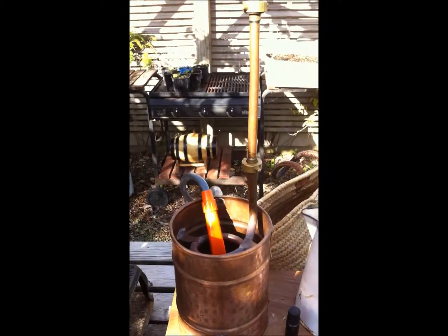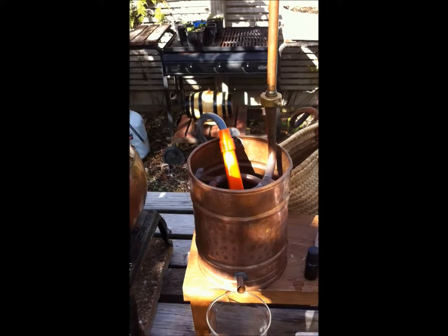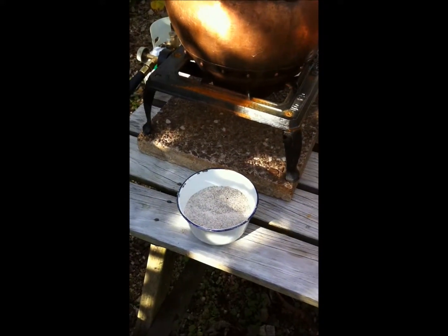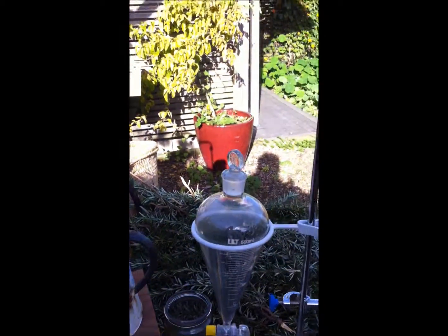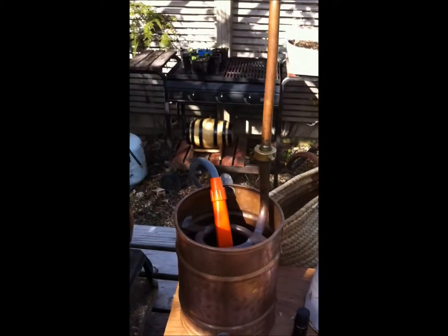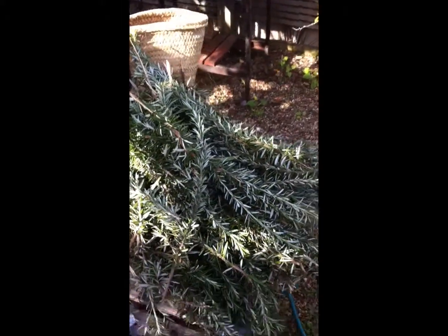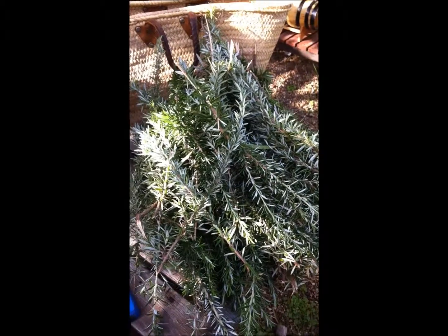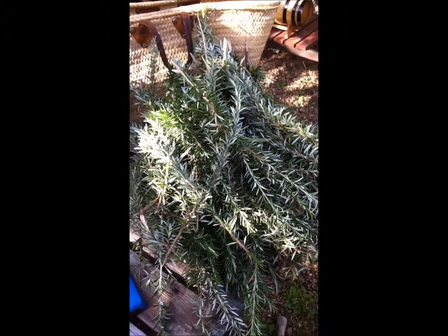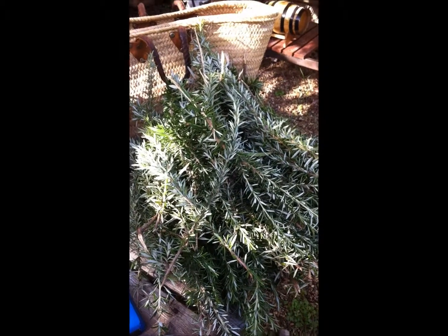I've already given it a good clean but this is just a double-check. I have my rye flower ready, my pH reader, my oil separators, my pump ready to go on the condenser bucket, and my harvested rosemary. It's just after the full moon — I should have harvested it before the full moon.